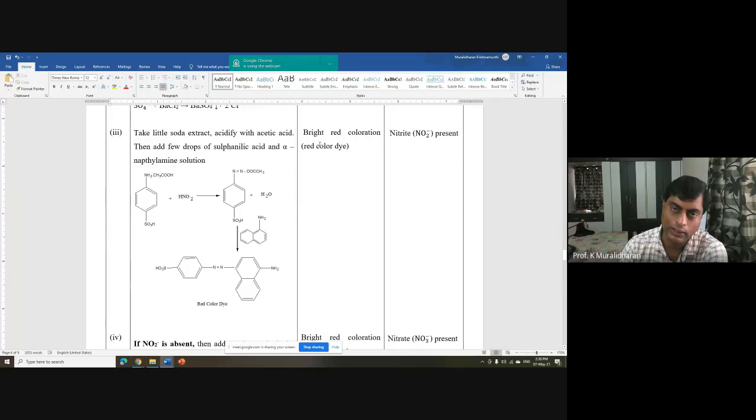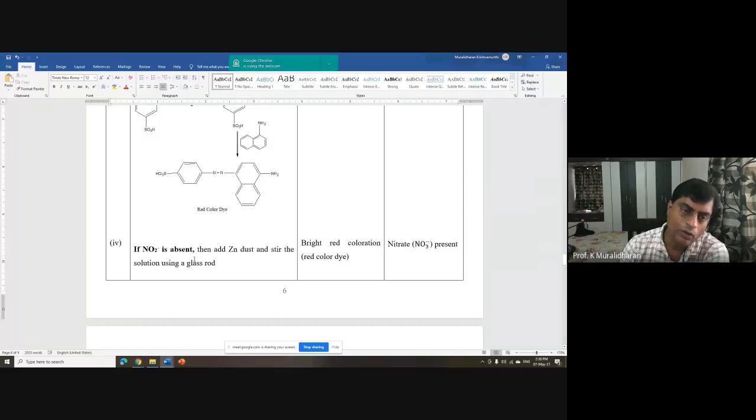So what do you do? You write it in such a way that it was acidified with acetic acid, a few drops of sulfanilic acid and naphthylamine were added, and no change in color was observed. Absence of nitrite. That's what you will get here. Now, because of this absence of nitrite, you go to this test.